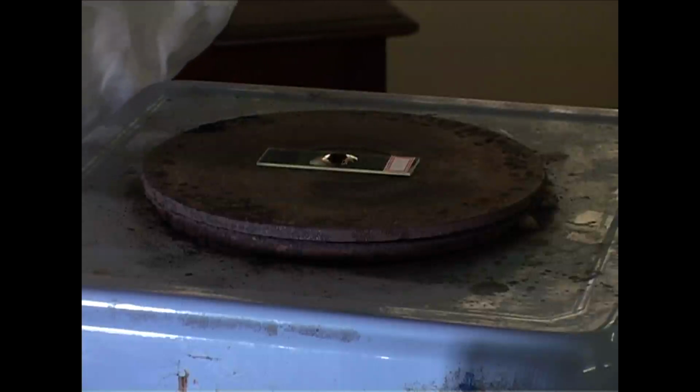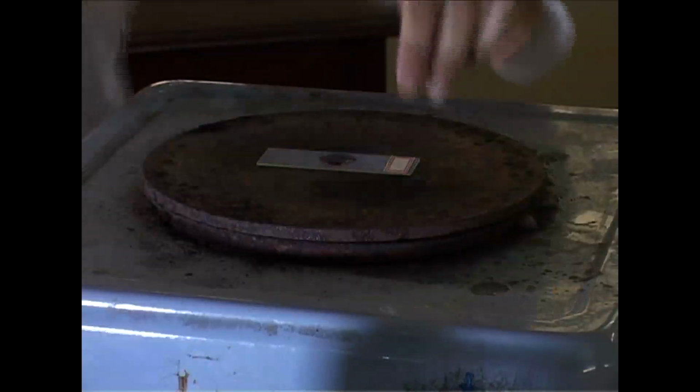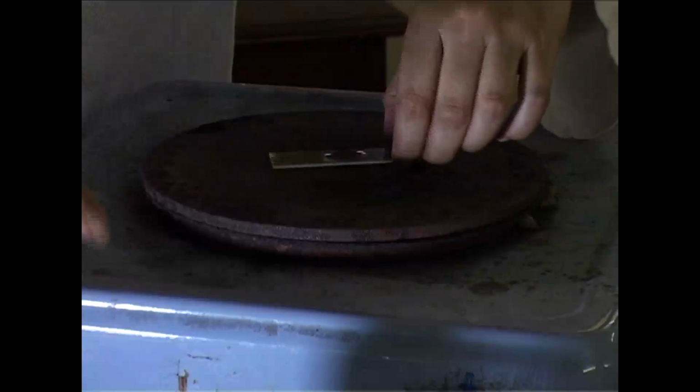Heating is applied during the application of primary stain, in this case carbol fuchsin, to facilitate the penetration of primary stain into the cytoplasm of bacterial cells. Then we keep it for 3 to 5 minutes on that hot plate.